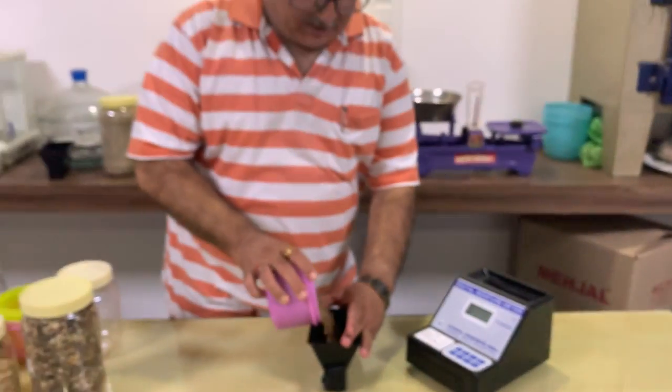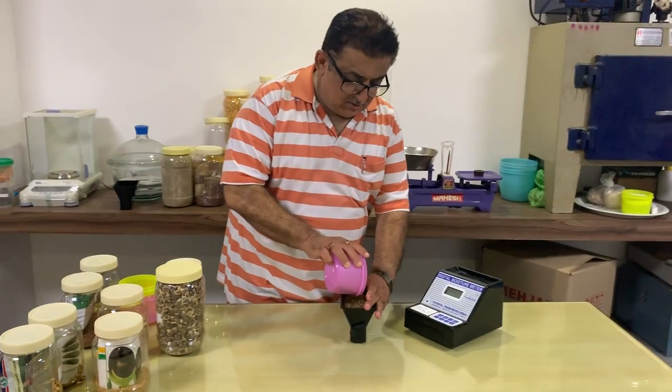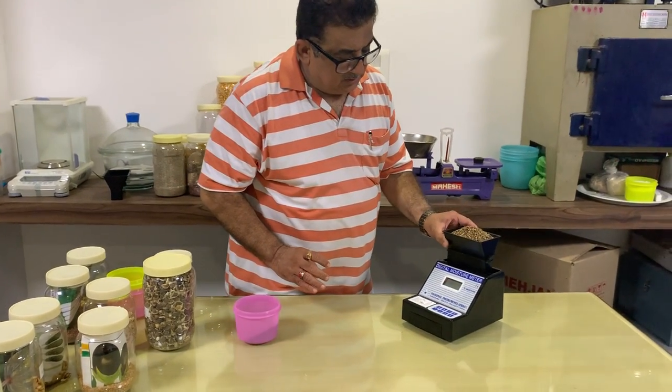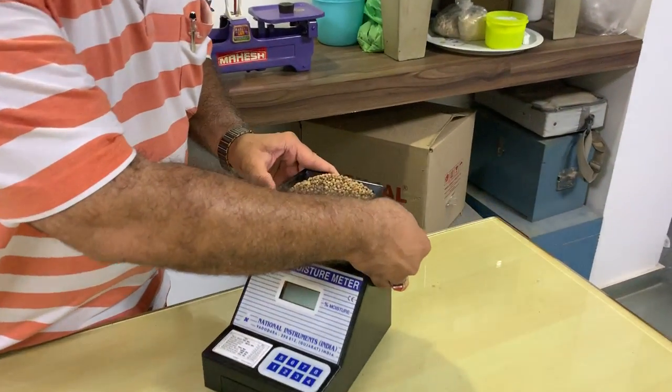Now I am putting the Guar seed inside the hopper. It requires a full volume fill, so I have taken the full volume of the hopper. Now I have placed the hopper on the instrument.